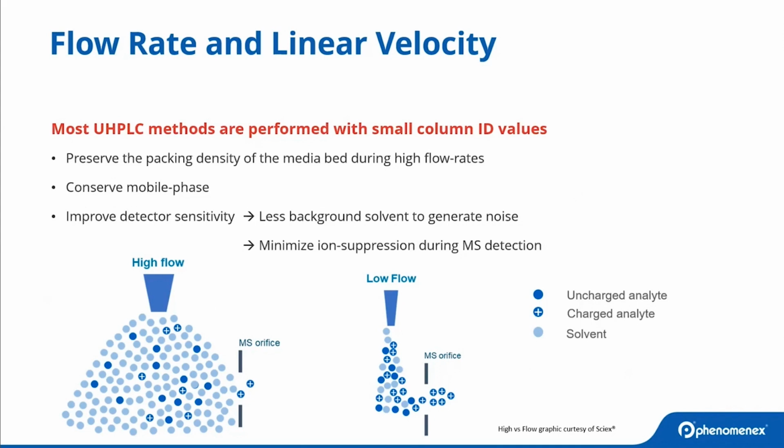And this ultimately presents challenges with respect to the sensitivity towards your actual analyte that is being introduced within that large volume of eluent. Certainly, you could just increase the mass load onto the column, but then you're once again running into complications with respect to the upper limitations of what your mass spec detector can handle.